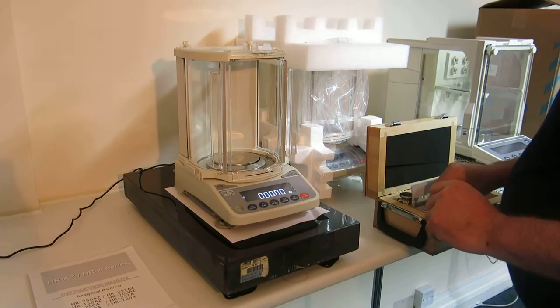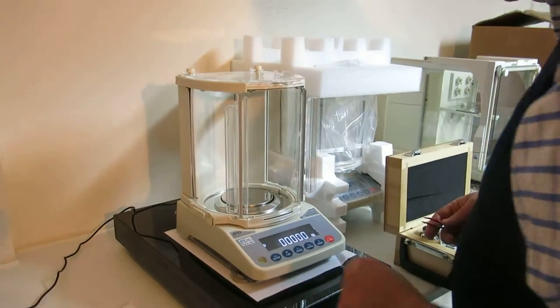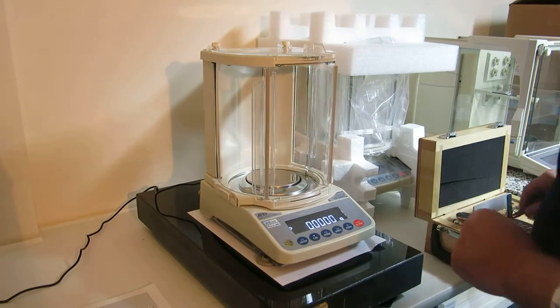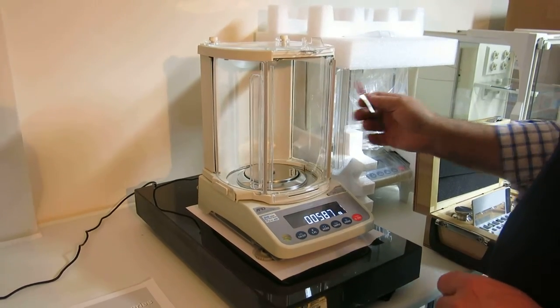The other real benefit with it is the fact that it's got a small footprint. It will sit on an A4 piece of paper, which is extremely useful. So let's just put a couple of balance weights on here. See how we go.